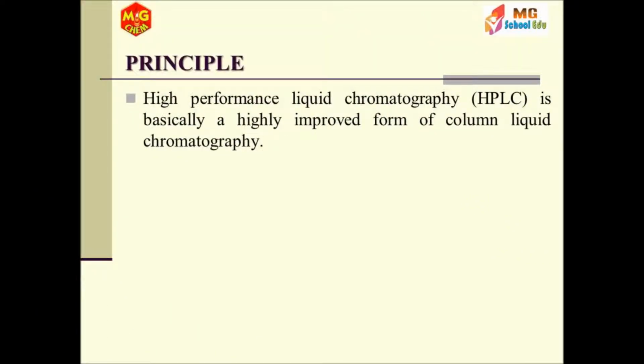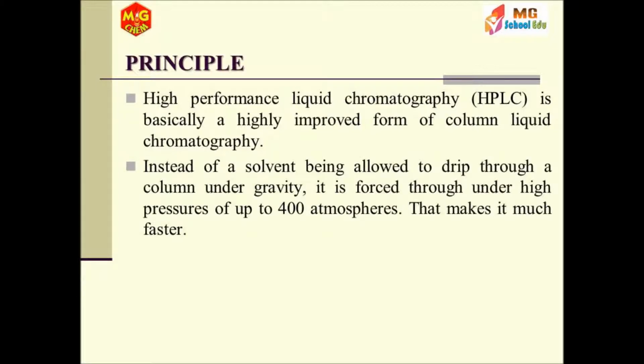Principle of HPLC. High Performance Liquid Chromatography, HPLC, is basically a highly improved form of column liquid chromatography. Instead of a solvent being allowed to drip through a column under gravity, it is forced through under high pressures of up to 400 atmospheres. That makes it much faster.